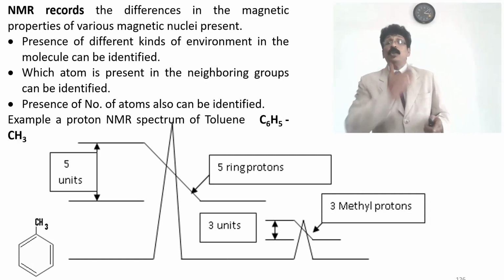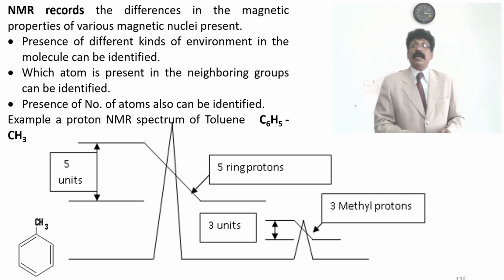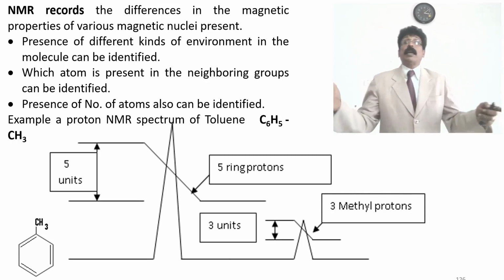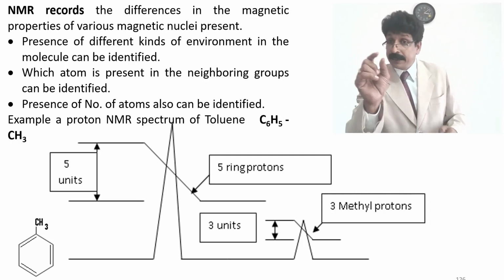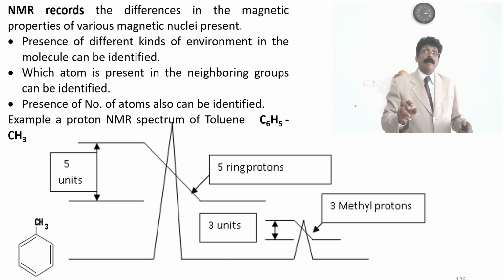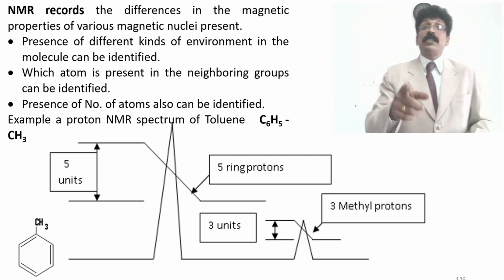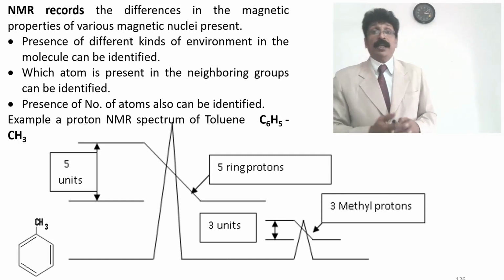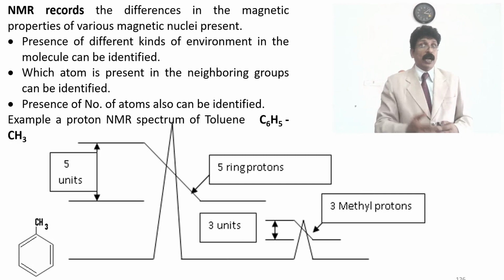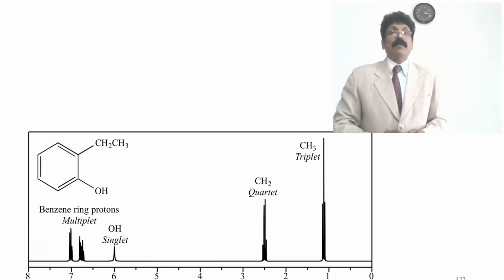You will get the concentration, the delta will be on the x-axis, so that you can compare this with, as I told, the molecule which has 4 methyl groups on silane. Tetramethylsilane is the one compound which is used as a standard for identifying various protons, and even for carbon.